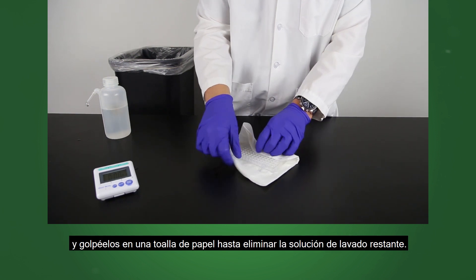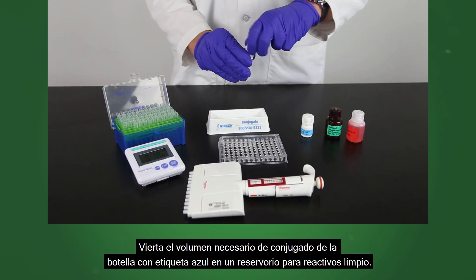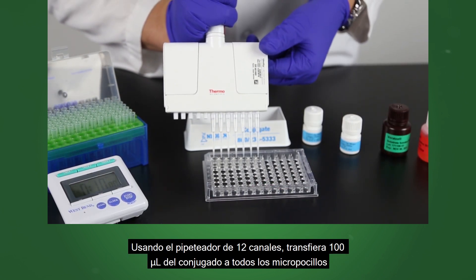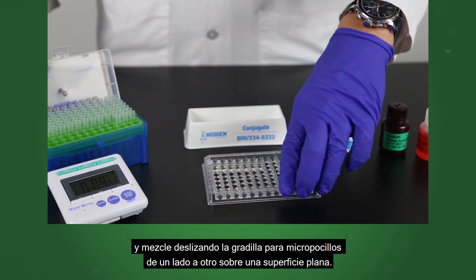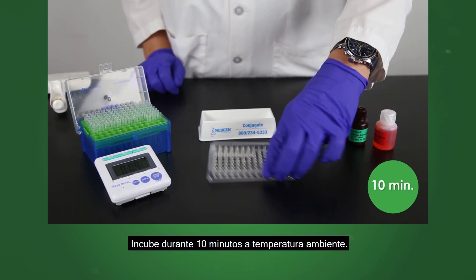Turn the wells upside down and tap out on a paper towel until remaining wash solution is gone. Pour the needed volume of conjugate from the blue labeled bottle into a clean reagent boat. Using the 12 channel pipetter, transfer 100 microliters of conjugate into all the wells and mix by sliding the microwell holder back and forth on a flat surface. Incubate for 10 minutes at room temperature.